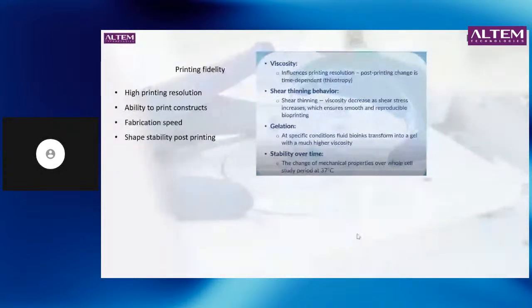Next is gelation. Gelation, like I said, depends on the transition temperature, the gelation temperature, or the presence of materials, presence of physical factors that will eventually lead to cross-linking or polymerization of the material. So at specific conditions, fluid bioinks transform into a gel with a much higher viscosity.